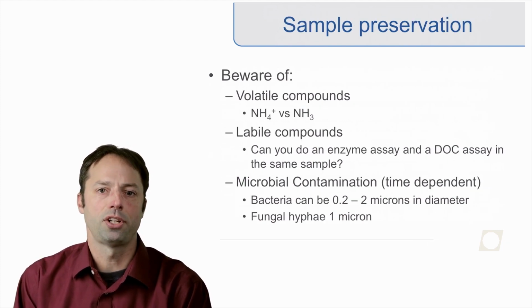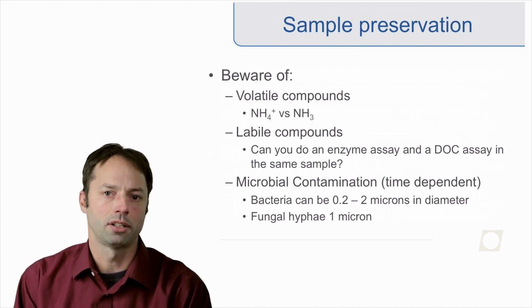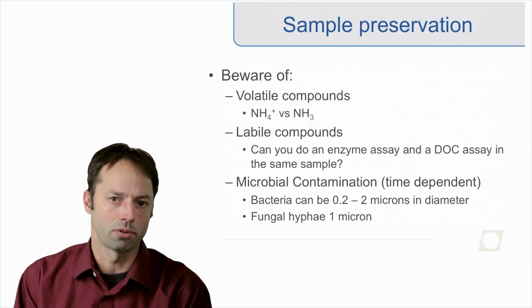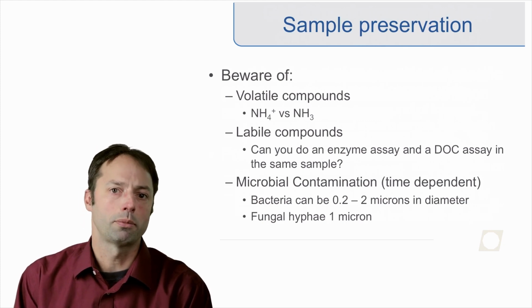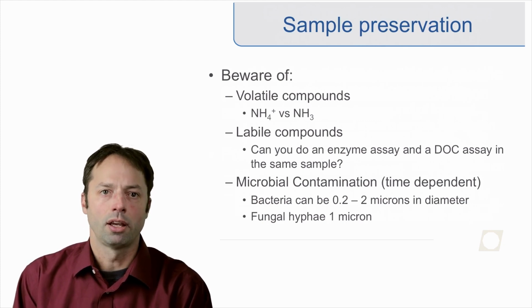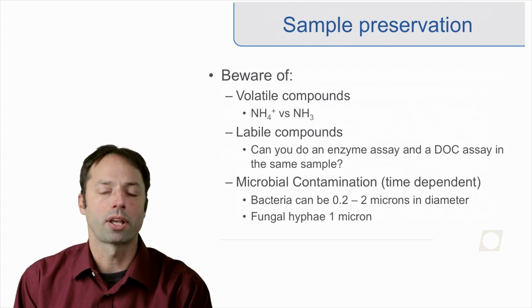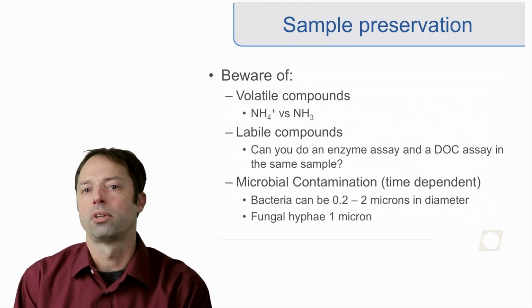Now, sample preservation. Recall in Leo's talk, you've got a sample bottle out there collecting water. Some methods you're collecting your sample over just a matter of hours or minutes. Some methods you may have your sample bottle out there for days, and you want to do your best to preserve that sample and be aware of what can happen to your sample while it's out in the field or being transported to the laboratory.